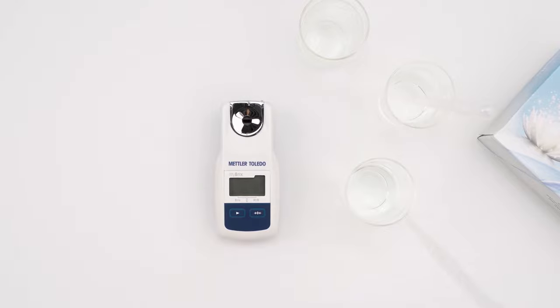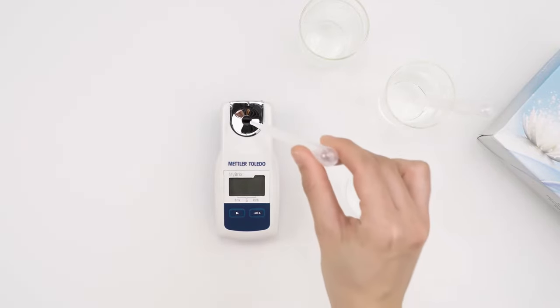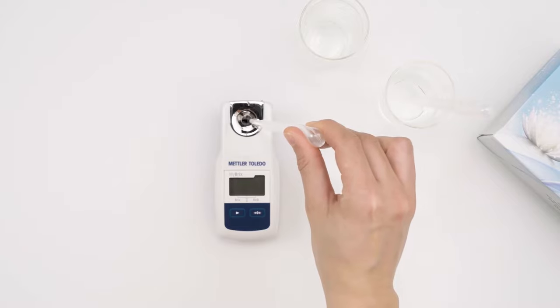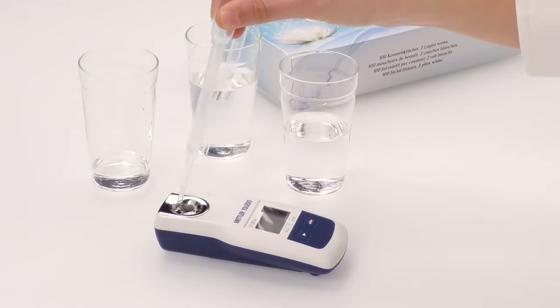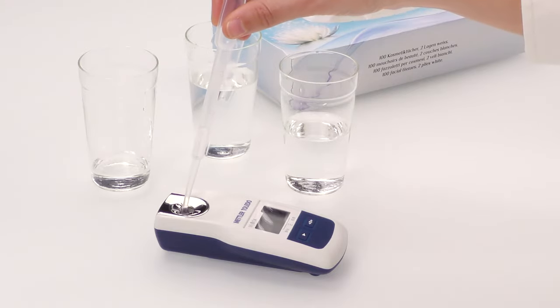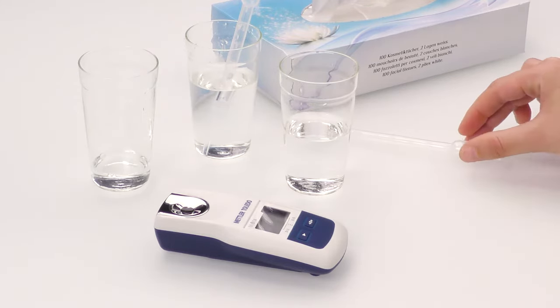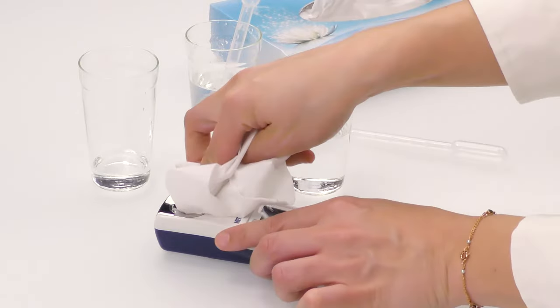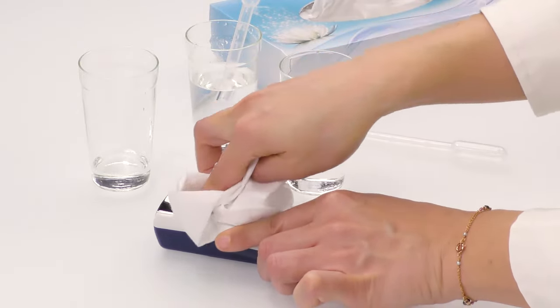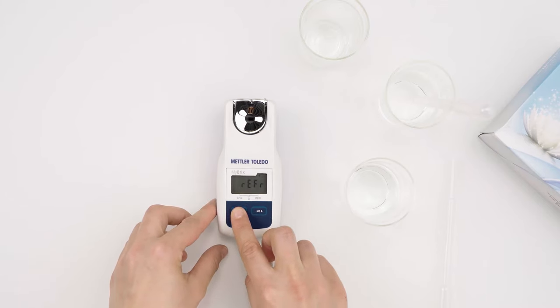Clean the instrument thoroughly with pure water. Dry the instrument with a lint-free tissue. Press the READ key to turn on the instrument.